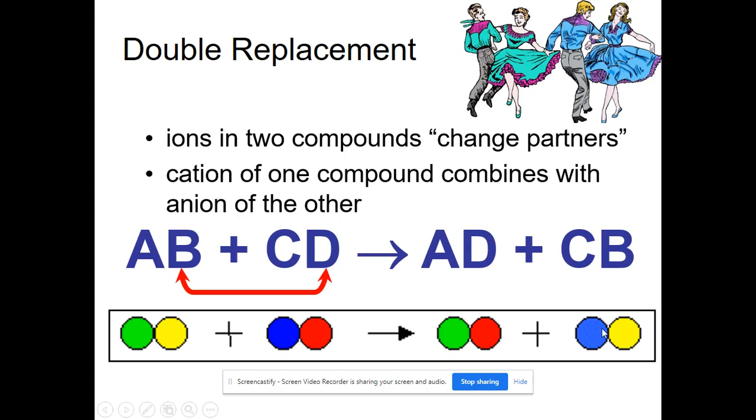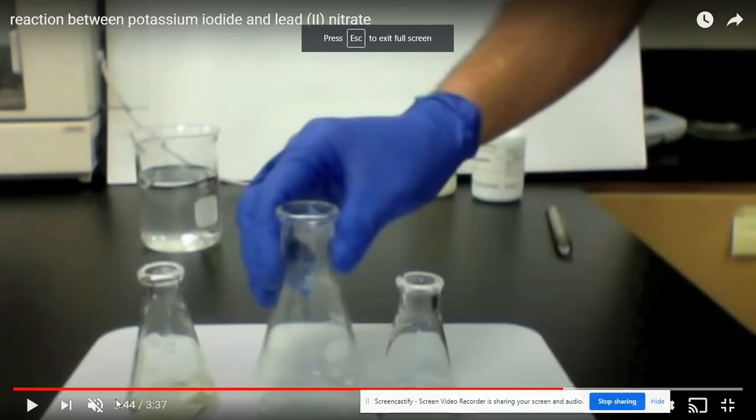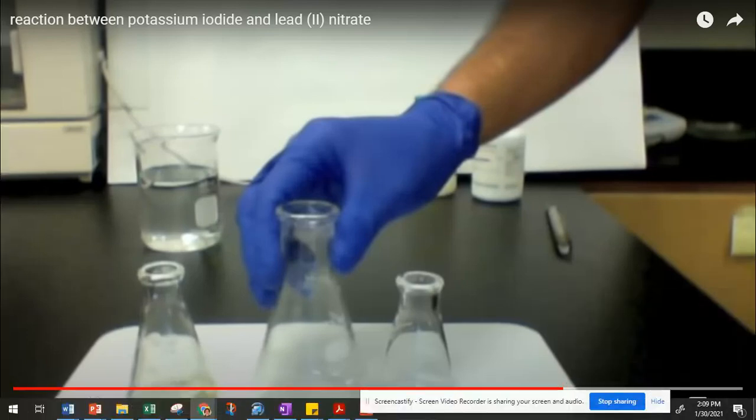Okay, so I'm going to first show you an example of a double replacement reaction, and then we're going to go over the reaction that you saw occur. In this video, we're going to watch the reaction that occurs between lead 2 nitrate and potassium iodide. The left-hand Erlenmeyer flask, if you look closely, has a pale yellow solution, and that's our potassium iodide in solution. The right-hand Erlenmeyer flask is a solution of lead 2 nitrate.